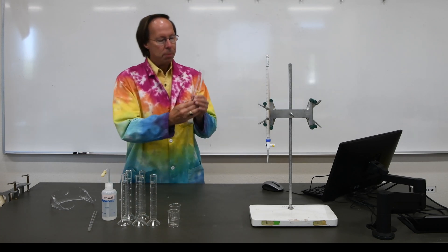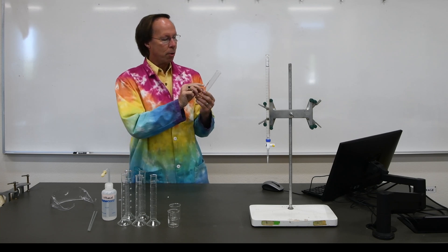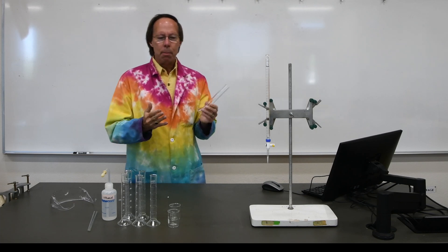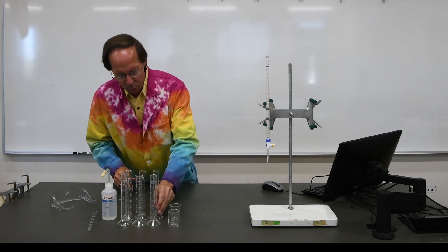We'll also look at a 50 milliliter graduated cylinder. The graduated cylinder is marked off in individual milliliters, so we can do a much more accurate job. If you need moderate accuracy, these graduated cylinders work very well.